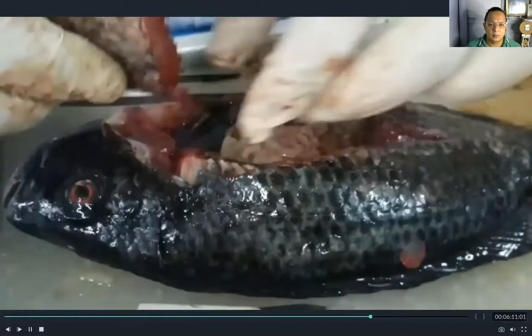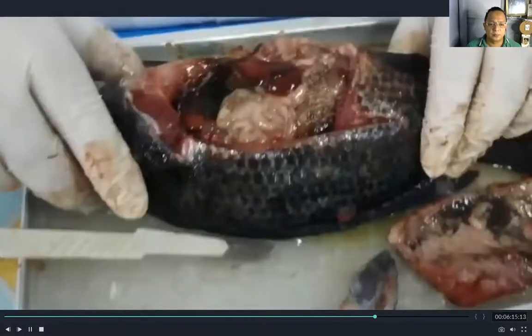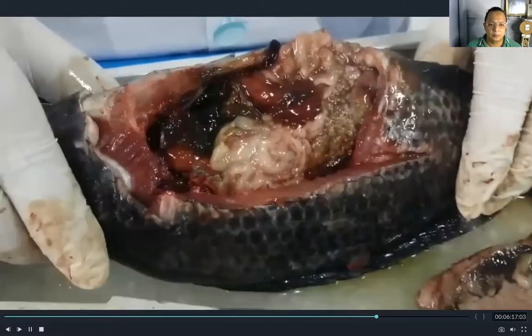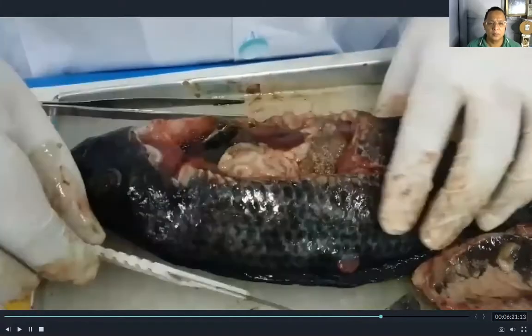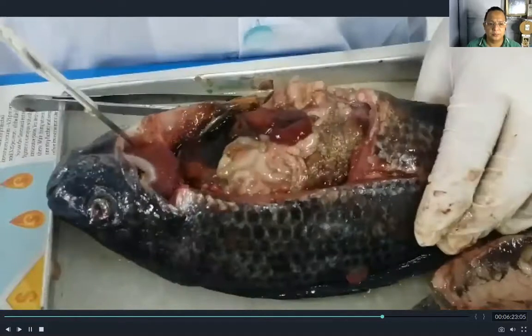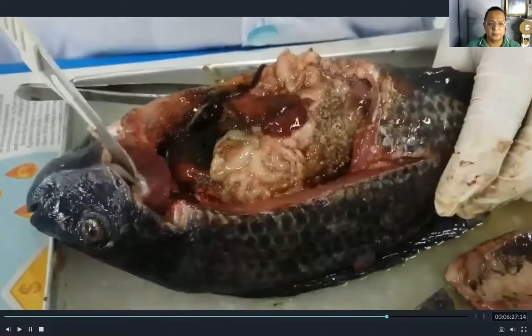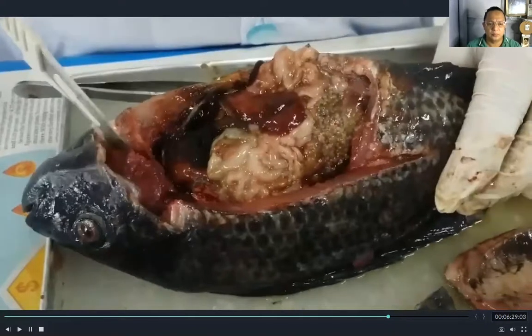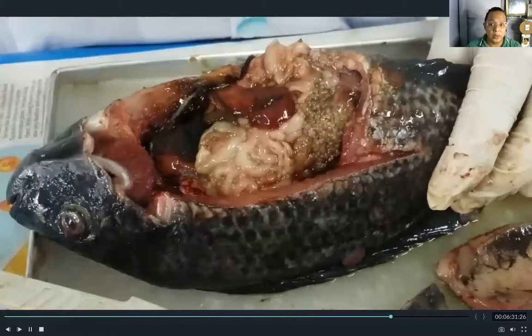So this is the internal parts of the tilapia — these are the internal organs. Let us start with the gills. Again, the gills help the fish to breathe, and the gills are the breathing organ of the fish.